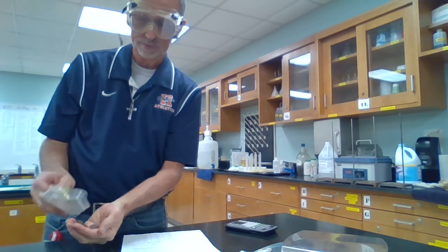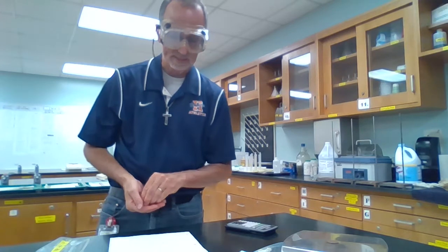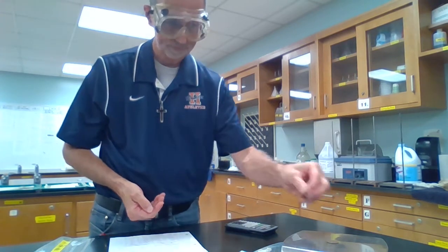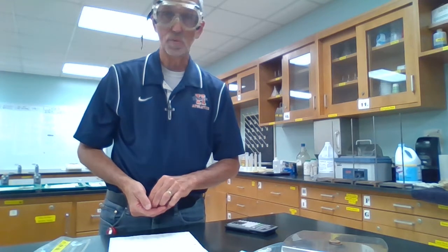Got them right here. And of course, we've already filled in the first line, which is 0 grams. So 1 penny. I'm going to go right down the far left column. We'll get the masses of the set A pre-82s. 1 penny is 3.08 grams. 3.08. 2 pennies, 6.21 grams. 6.21.